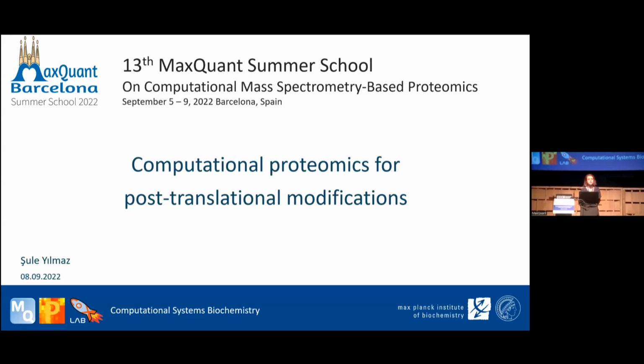So hi everyone, and now we are going to talk about computational proteomics for post-translational modification. I know that in the last days we heard several times about PTMs. Almost all of our plenary speakers talked about some PTMs, like we started with cancer and phosphorylation, and then we heard about protein histidine phosphorylation. And even today, Dr. Paolo Picotti was mentioning osmotic stress, and then on the pathway there was some phosphorylation event occurring.